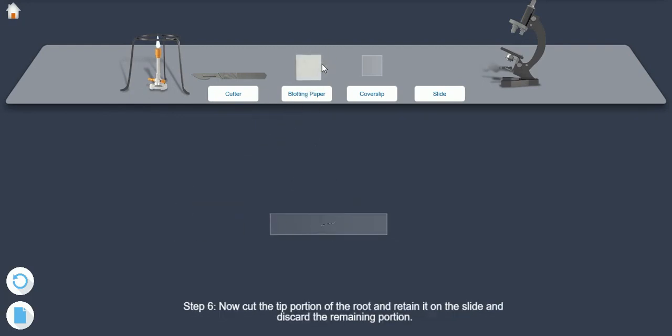Step 6. Now cut the tip portion of the root and retain it on the slide and discard the remaining portion.